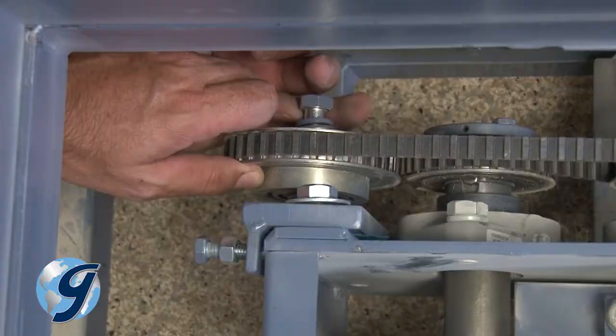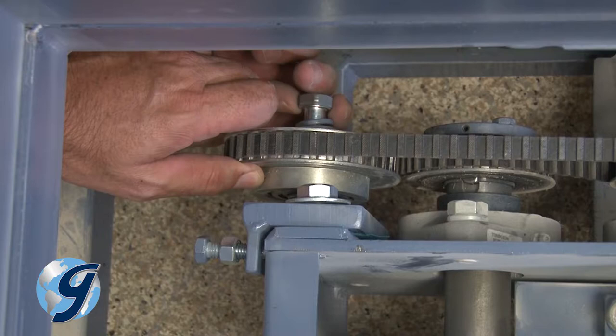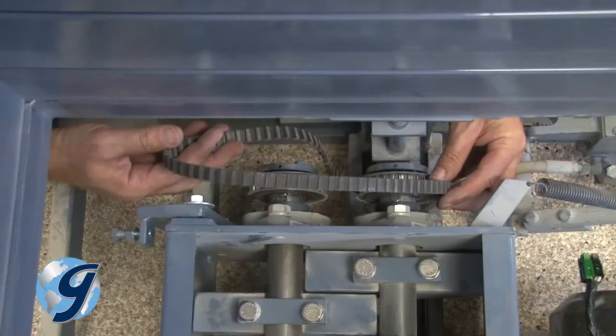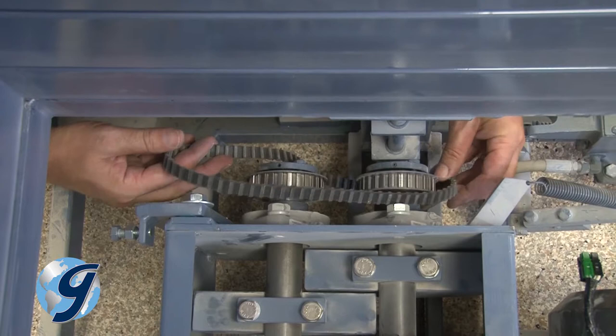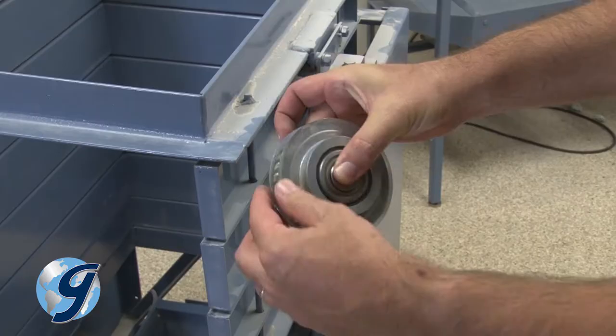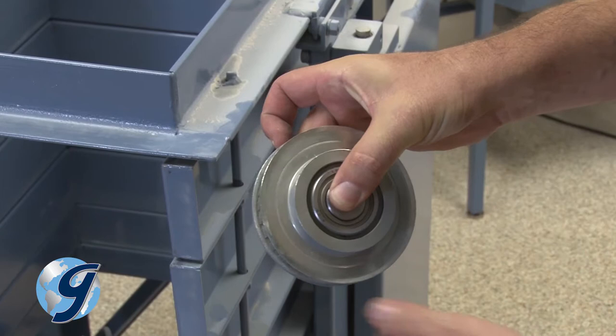To reseat or replace the timing belt, loosen the bolts at the tensioning bracket. This allows the tensioning bracket to pivot towards the front of the machine, thereby loosening the tension on the timing belt. Remove the bolt that secures the tensioning pulley to the tensioning bracket. Now remove the tensioning pulley. Next, remove the timing belt. Inspect the timing belt for damage and obtain a replacement if necessary. Take this opportunity to check the condition of the tensioning pulley and its bearings. If it does not spin smoothly, the bearings will need to be replaced.